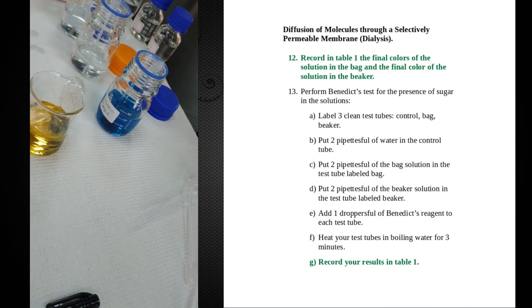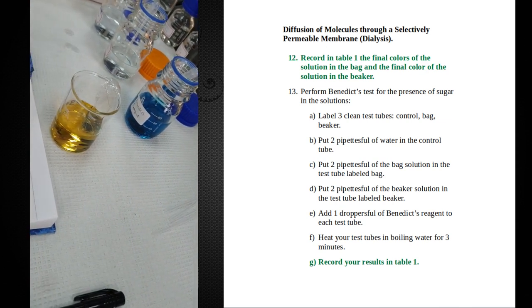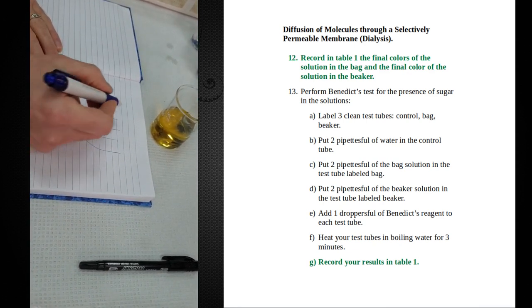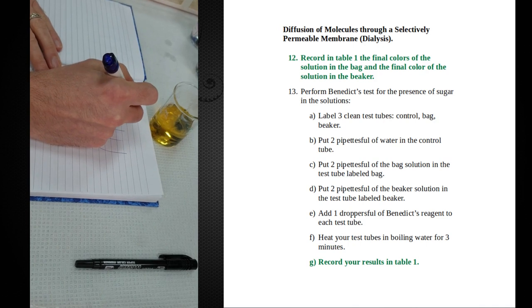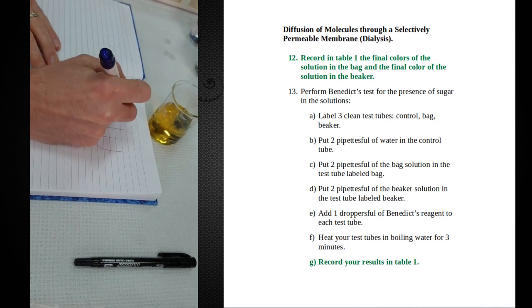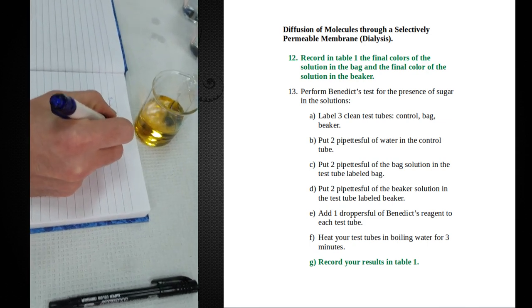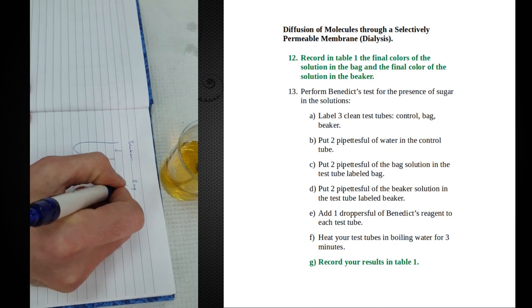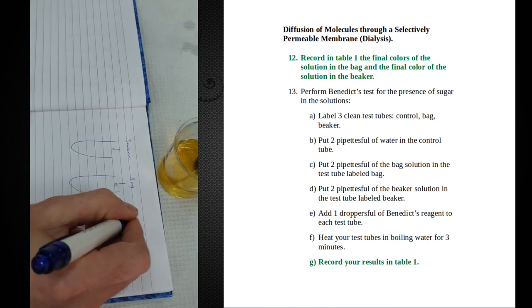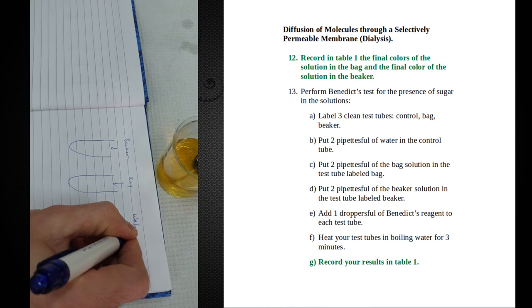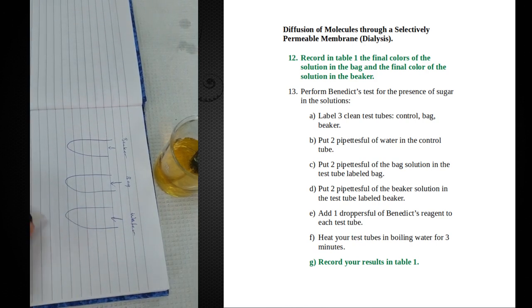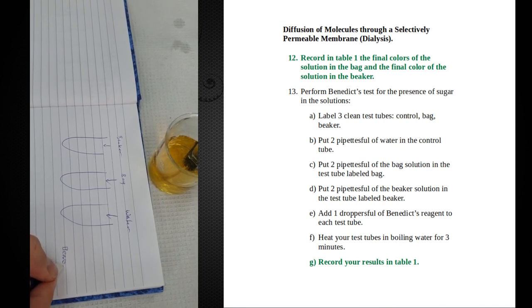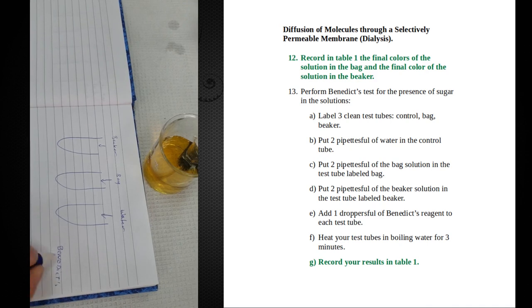We're going to set up three test tubes. One of them will get the contents of the beaker. One of them will get the contents of the tubing, so the bag. And one of them will get water. To each one of these, we will add some Benedict's reagent.